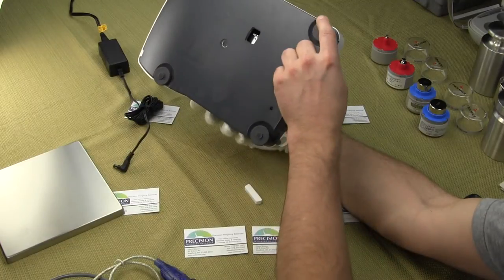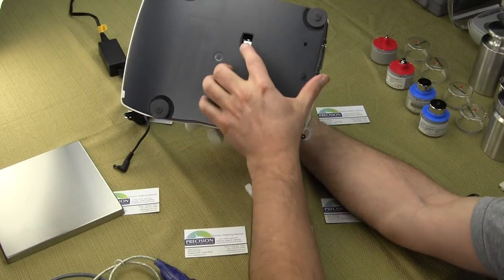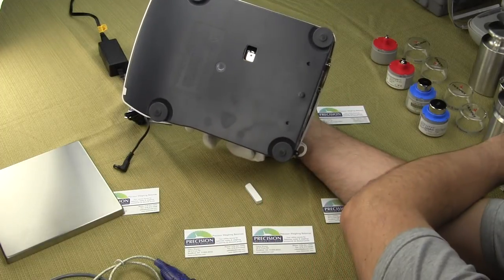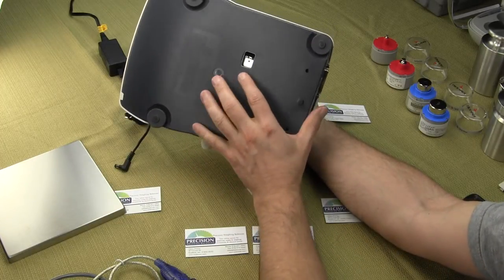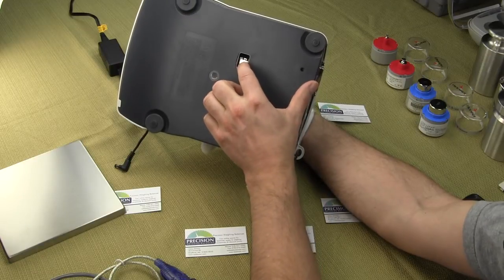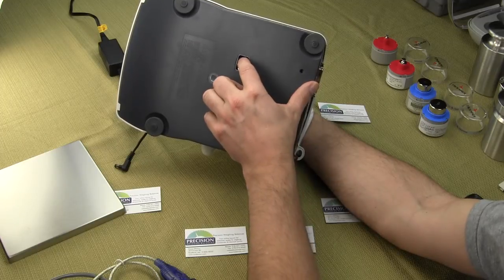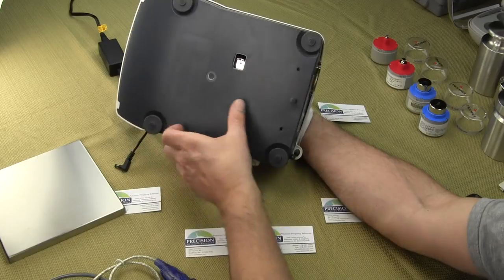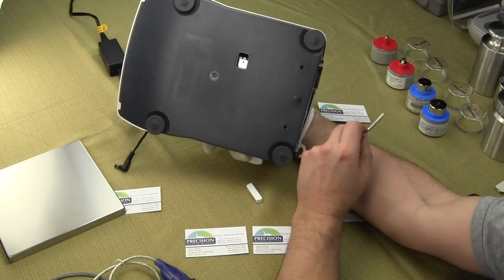On the bottom, you'll see there are four adjustable feet on this particular model. I opened up the bottom of the balance here — there's a port, and this port is for an underhook. Your monolithic weigh cell is right here on the bottom. There is a little spot where you could put a wire or a thread to hang beneath the balance for doing specific gravity.